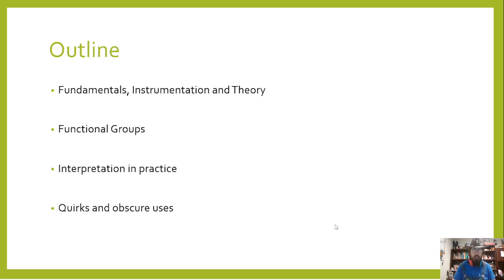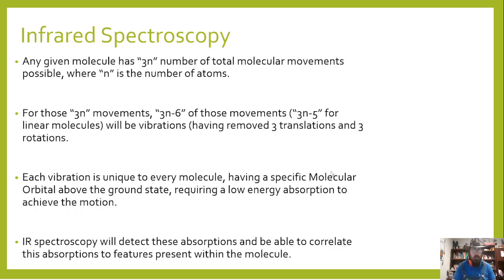So, once again, we'll go through our fundamentals, how it's supposed to work, the functional groups, how to interpret this, and some of its stranger uses. So the idea here is that molecules have various degrees of motion and that are all energy based.